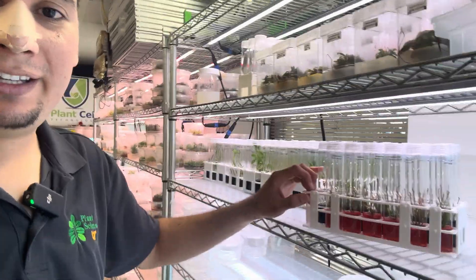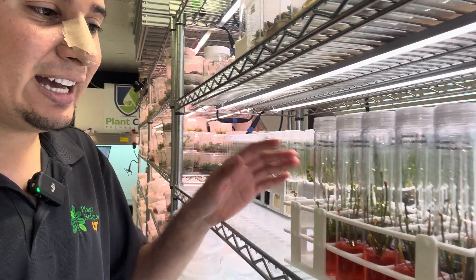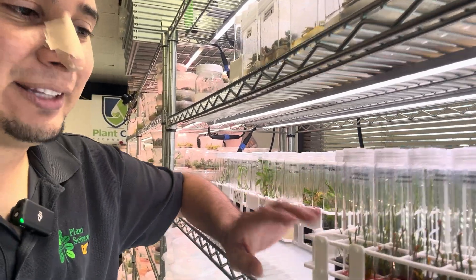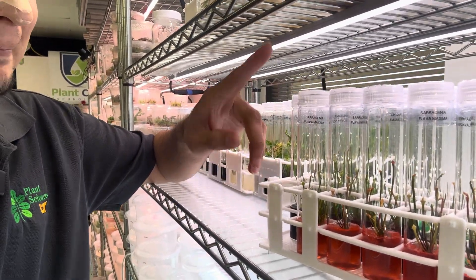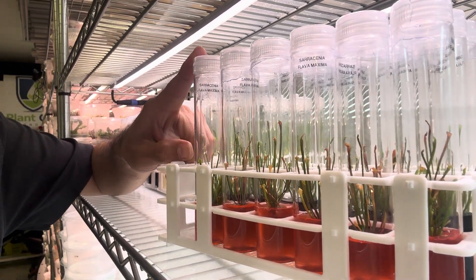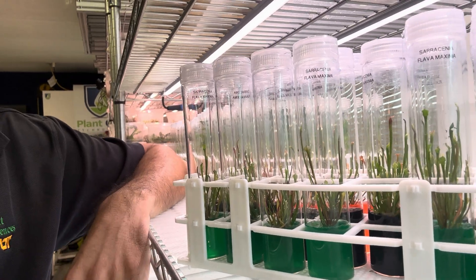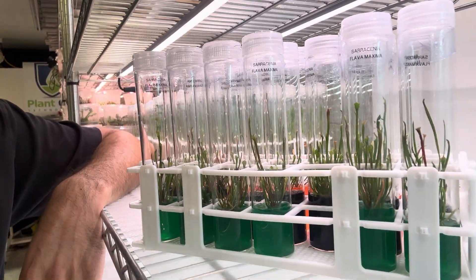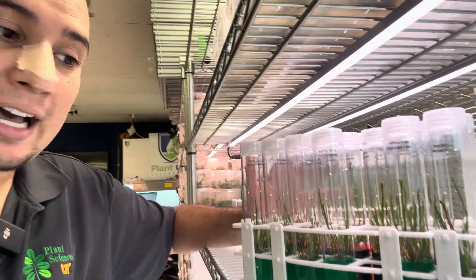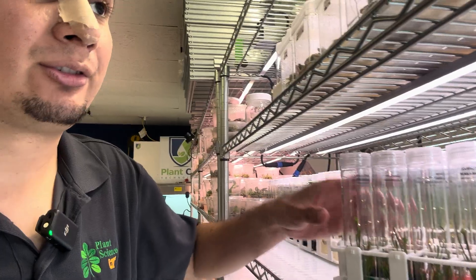Another update: these are the Sarracenia flava maxima from the Christmas video. I actually only gave away two plants, so I still have a lot of these plants. I think I want to save the ones in the red media to give away on Valentine's Day, and the ones on the green media I'll probably give away or save for St. Patrick's Day. The great thing is there is no contamination at all — I used PPM on them and have no contamination.